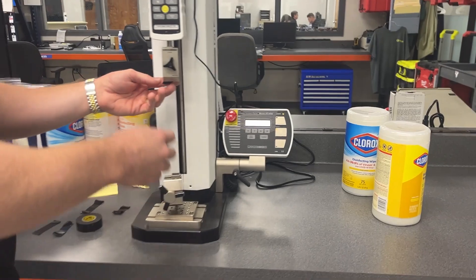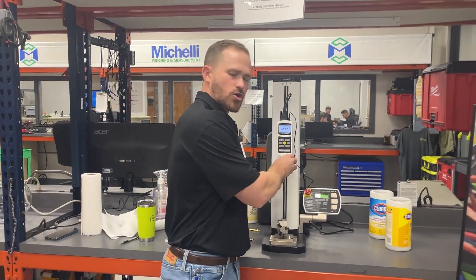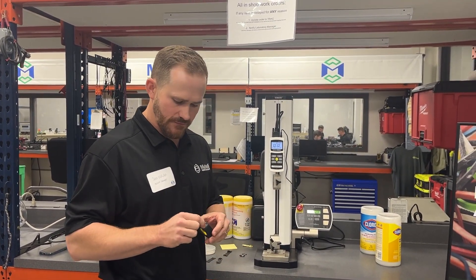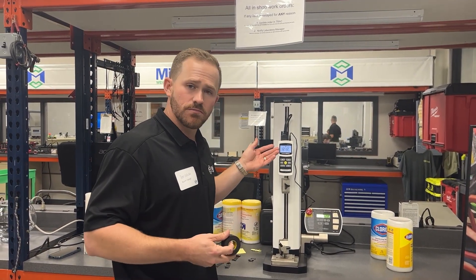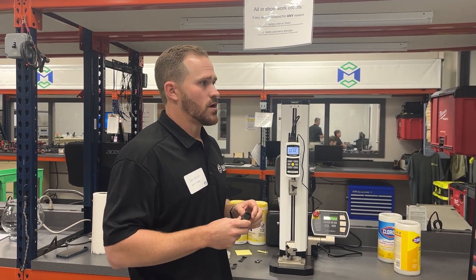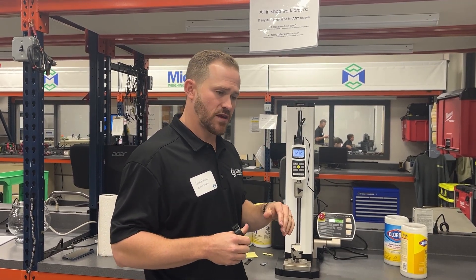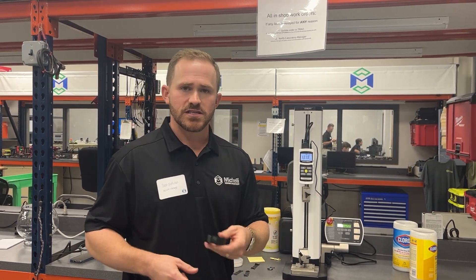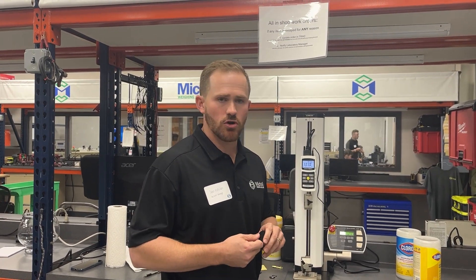You'll see right here it broke at 12 pounds of force. Their quality department will spec this out — they will find what's acceptable and what's not. Generally today it's been 12 pounds, so they might have a target of 13 or 11. If it's over, it's too strong; if it's under, it's too weak. Of course they don't want that hitting the market — too strong or too weak.